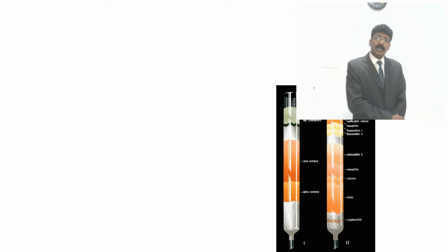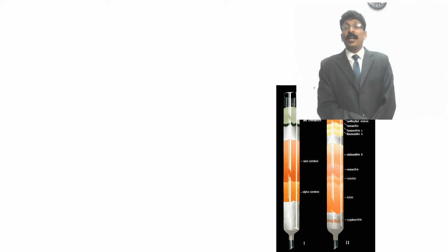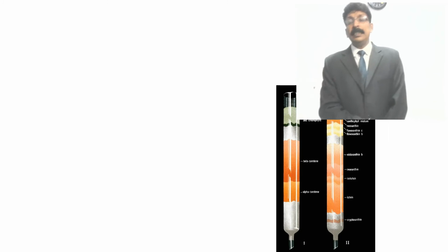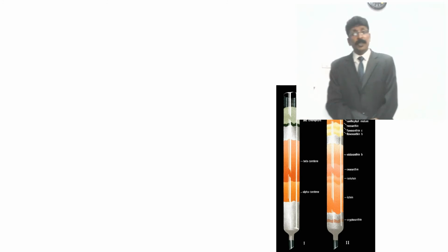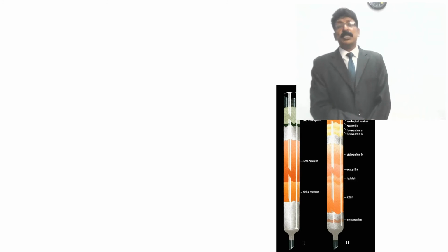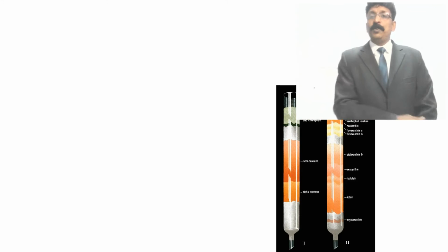This is another picture of column chromatography, where they have done a colored separation. They have added a mixture at the top and passed a mobile solvent through, and you can see the differences in color: light, dark, orange, yellow, and even a light cream or yellowish color. That is the separation of colored compounds in different bands, and these bands can be removed from the column, then another solvent can be used, or they can be cut into pieces, or you can use different types of solvents which solubilize each one at one stage, to separate these compounds.